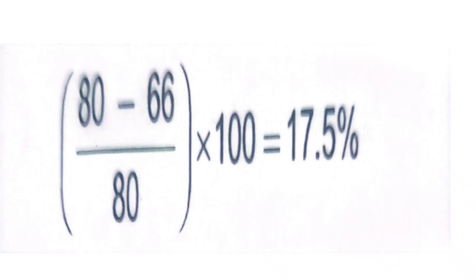So we do not have a strategy to be able to ensure that all the oxygen in the gas jar is being used. Therefore, the fact that we are not able to know that, then it means not all the phosphorus may have been used during the reaction, and that can pose as a source of an error.